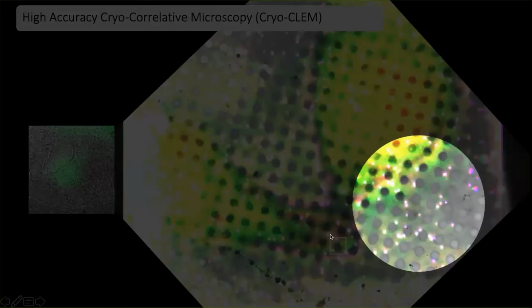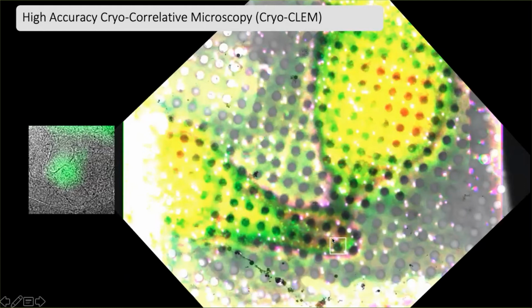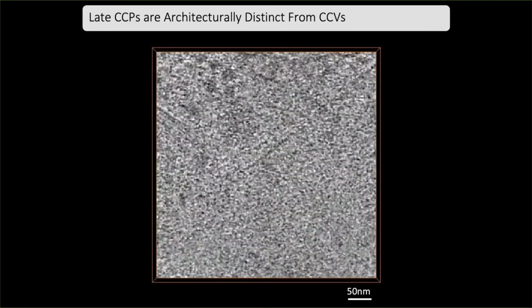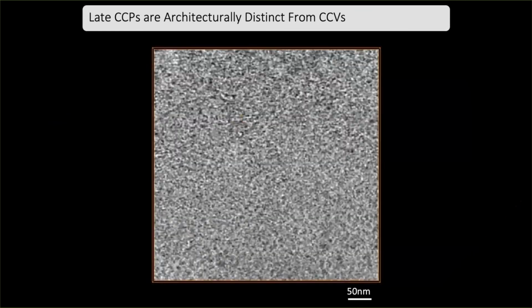If we are looking at thick cells, we are either restricted to the thin areas where they grow to thicknesses which are compatible with the electron microscope, or we would have to move to an approach that includes thinning the section even further. With this kind of imaging, though, with the cell relatively intact but restricted to the thin areas, you get sufficient resolution to resolve, for example, the clathrin coat in more detail.